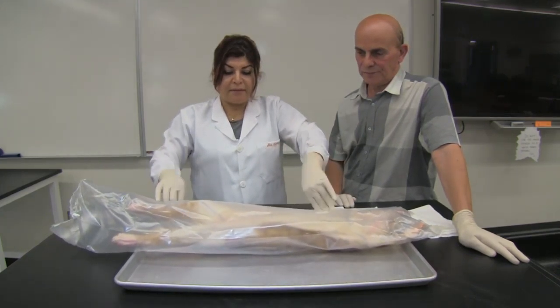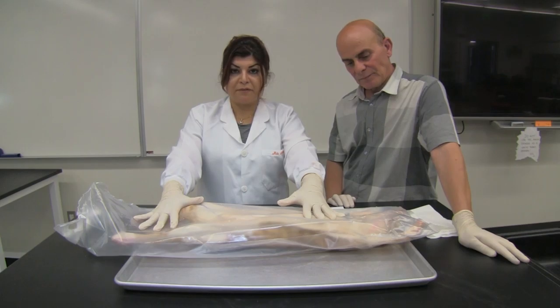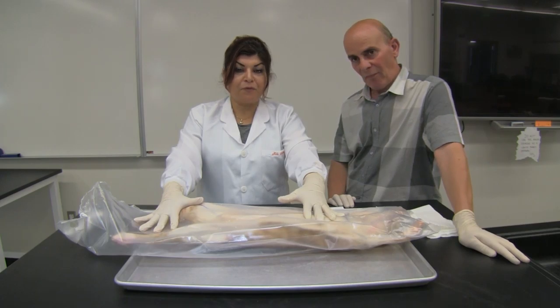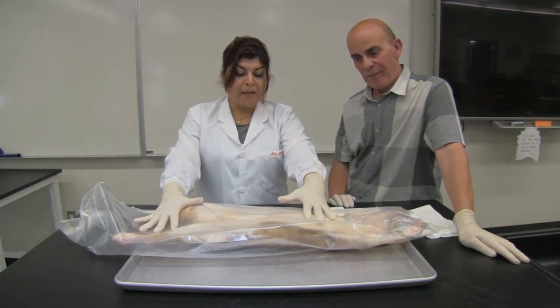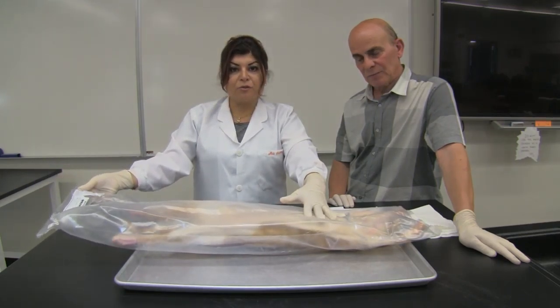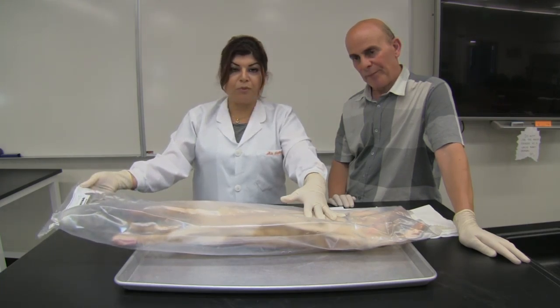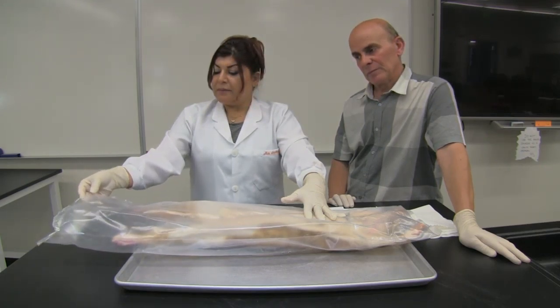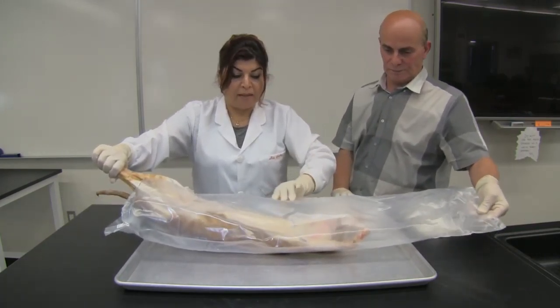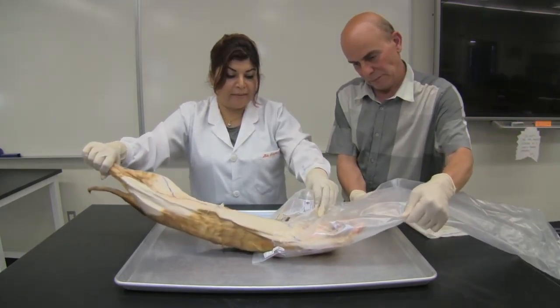This is our cat. They come in a separate bag, immersed in preservative fluid to keep the tissue moist and avoid bacterial infection. After you open the bag, there is a tag that each group is assigned. Each cat is assigned to a group of two or three students, depending. You take the cat out, and make sure not to lose the fluid inside the bag.